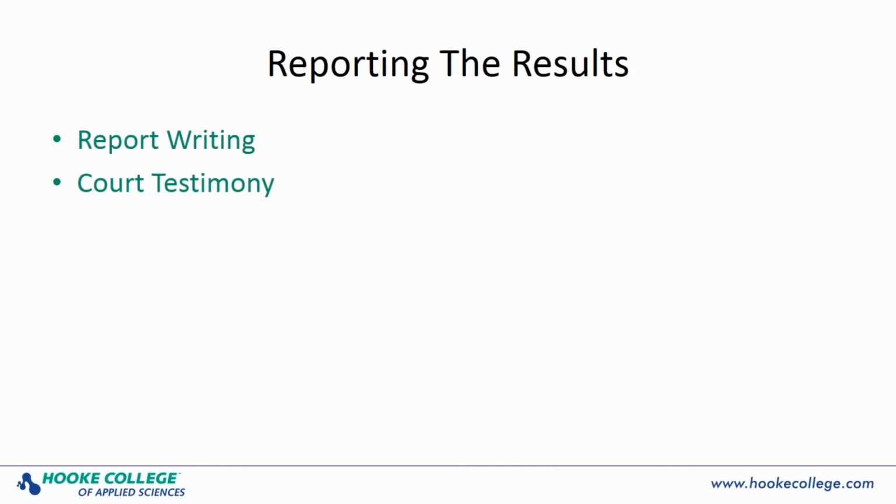Finally, it's important to remember that the analysis is not complete until a final report has been written. To assure the client that the approach to solving the problem was appropriate and that the testing performed was relevant, the original question posed to the analyst should be restated in the report. It is generally a good idea to keep the written report simple and only state factual conclusions, such as what tests were performed and the identity or characterization of the sample.